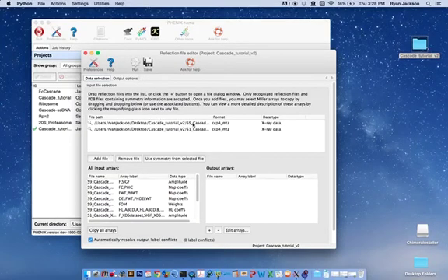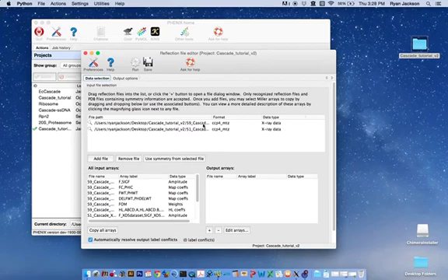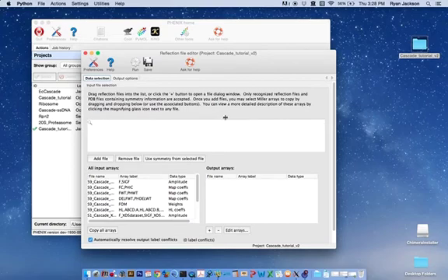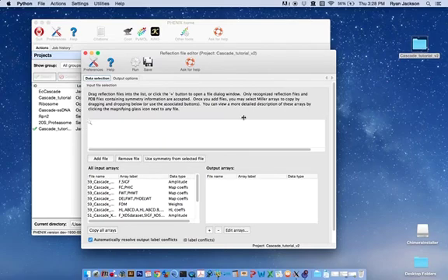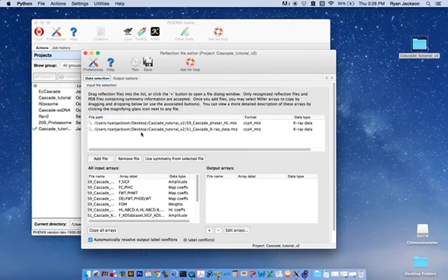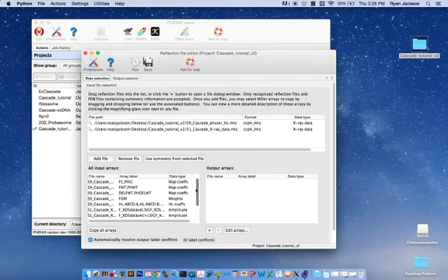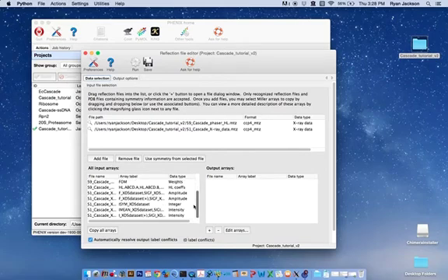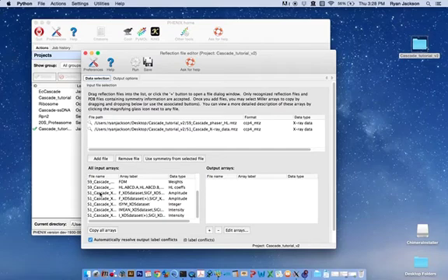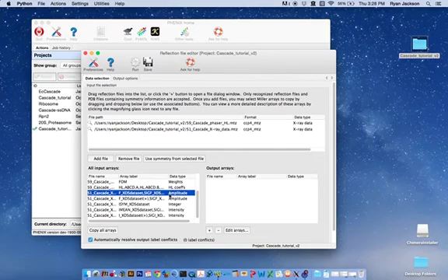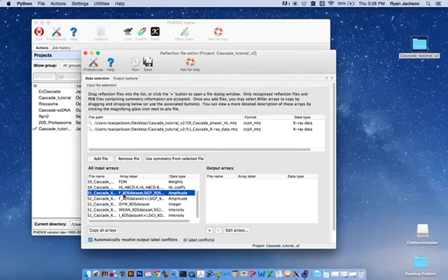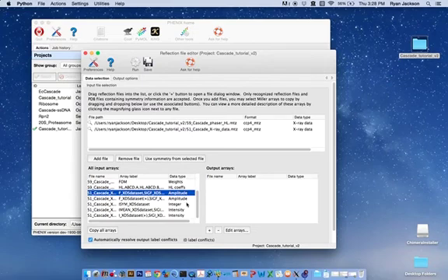Now we have low-resolution phases from our phaser solution with Hendrickson-Lattman coefficients and our high-resolution x-ray data. We need to merge these together. First thing to make sure we select correctly is the array in the x-ray data that is associated with the high-resolution amplitudes. In this case, I processed this data with XDS and XDS aimless, so my array is this F-XDS data set. I'm going to add that.